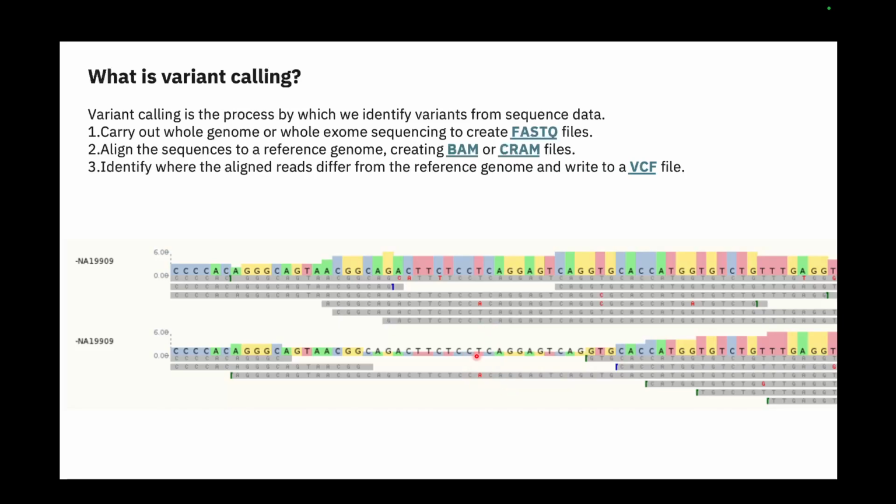Depending on how many reads support and what kind of nucleotide changes occurred, we will have a quality score associated with it, and also a depth associated with it. In the VCF file, as we'll see later, there will be a depth parameter which tells you how many reads are supporting this particular variation. Depending on that, we filter our variants and only take the high quality variants for further analysis. This is just to give you an overview of how you can visualize SNPs in the context of alignment and read depth.